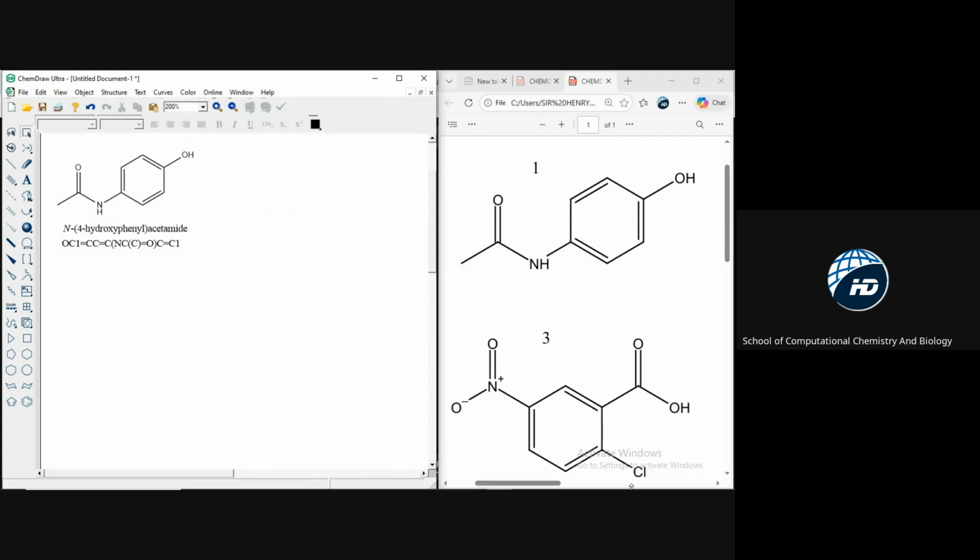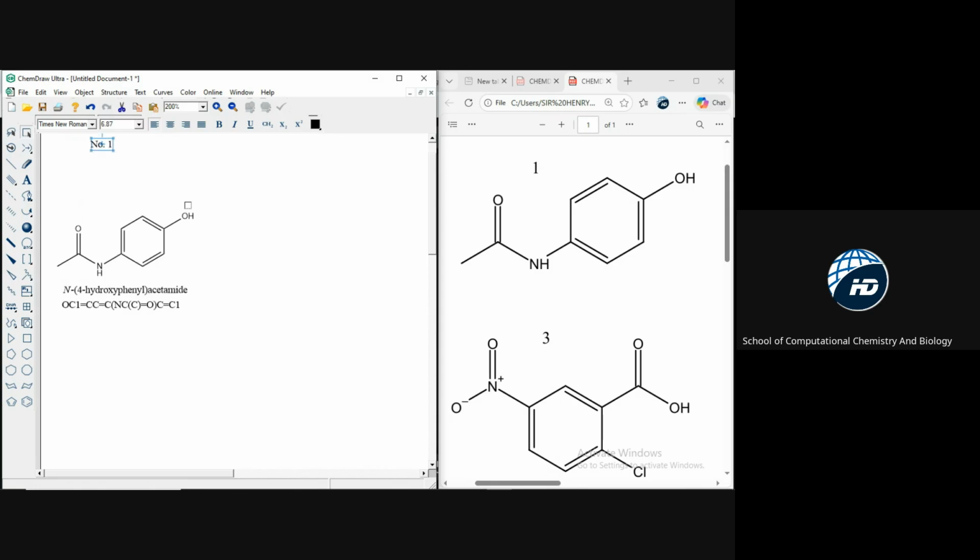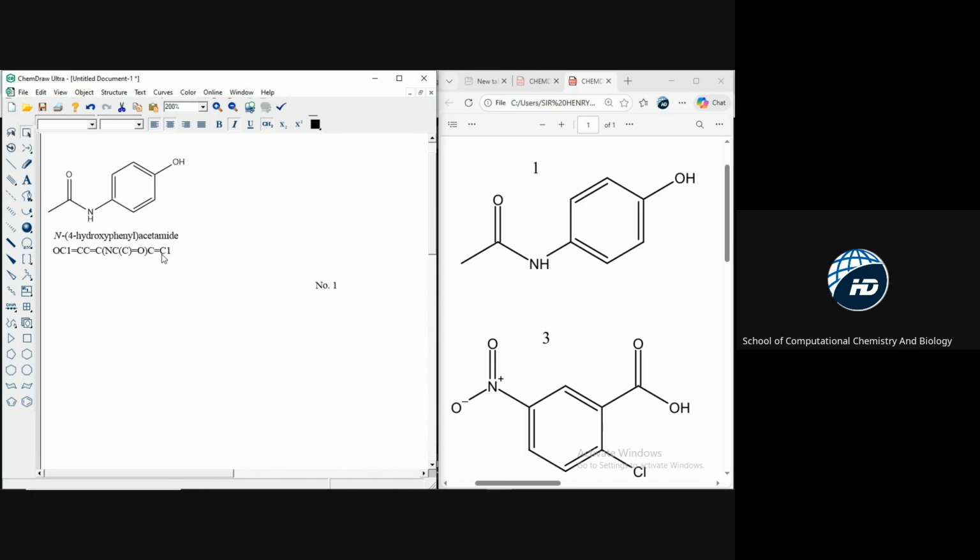All right. So that's for number one. You can label number one. Take your text, come to this up and put number one. So that is my number one structure. I don't know why this is going down. Okay, so let us draw, let's look at the number 2 structure.